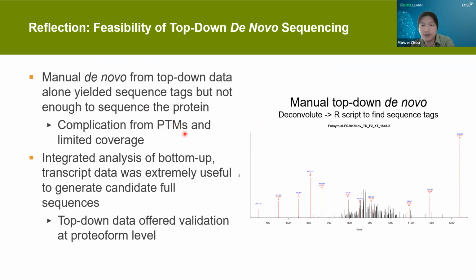The challenge is that even though I tried multiple dissociation methods, with the electron-based methods, electron transfer dissociation, and collision-induced dissociation, once you have PTMs like glycosylation, that really complicates things and limits your sequence coverage. So with the limited sequence coverage, you can really not go very far. That makes it hard if you don't really have a genome or some kind of reference sequence to compare with.